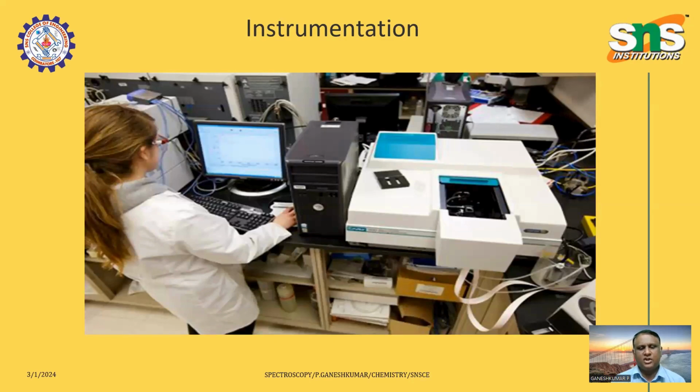So this is a typical picture of the UV spectroscopy instrument connected to a software. Once the analysis is done, they will get a software reading as a notepad.